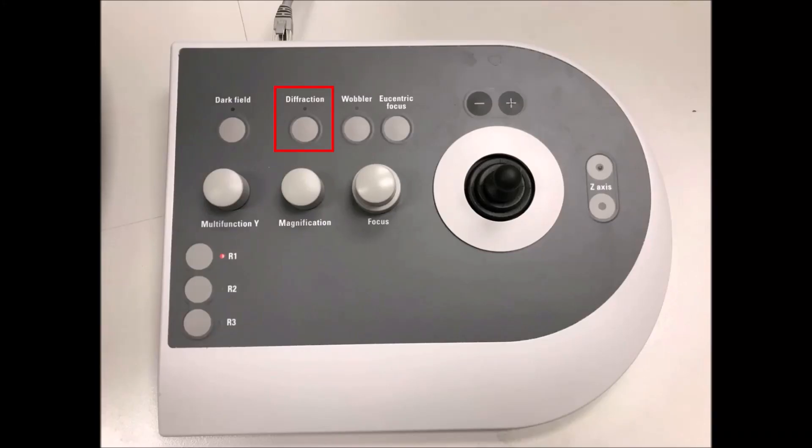So how is zone axis alignment performed? Well, for starters, you have to be in diffraction mode. So that's the first thing, hit that diffraction button on your right-hand panel.